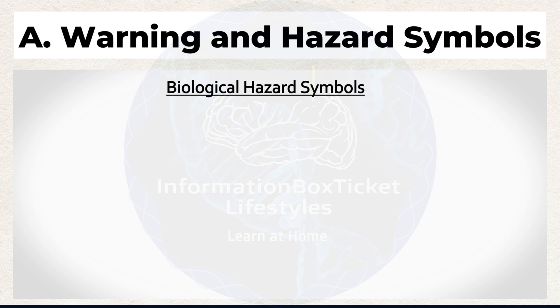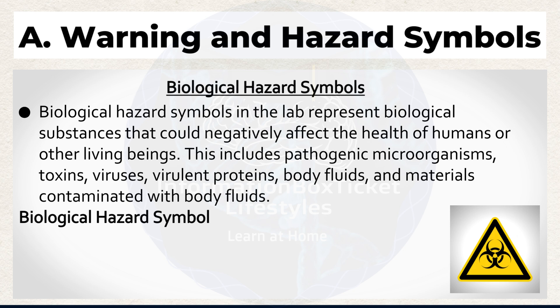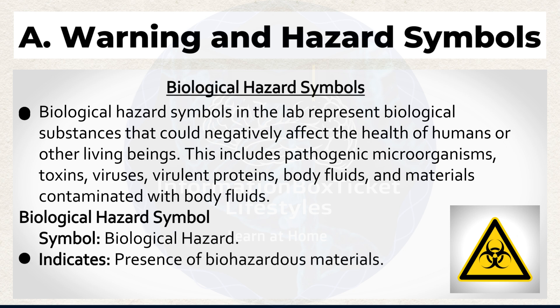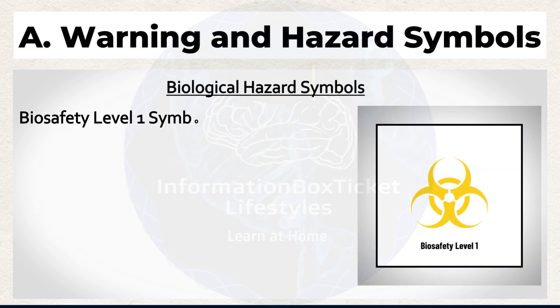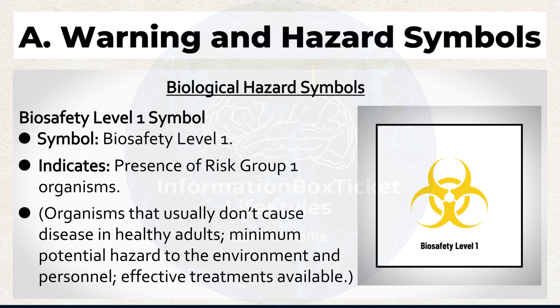Biological hazard symbols in the lab represent biological substances that could negatively affect the health of humans or other living beings. This includes pathogenic microorganisms, toxins, viruses, virulent proteins, body fluids, and materials contaminated with body fluids. Biological Hazard symbol indicates the presence of biohazardous materials. Biosafety Level 1 symbol indicates the presence of Risk Group 1 organisms — organisms that usually don't cause disease in healthy adults, with minimum potential hazard to the environment and personnel, and effective treatments available. Biosafety Level 2 symbol indicates the presence of Risk Group 2 organisms — organisms that can cause mild infections, moderate hazard to environment and personnel, less likely to spread through aerosol, with treatment and prevention available.